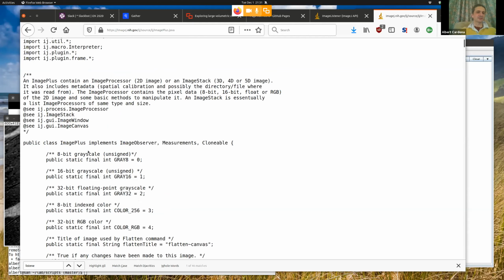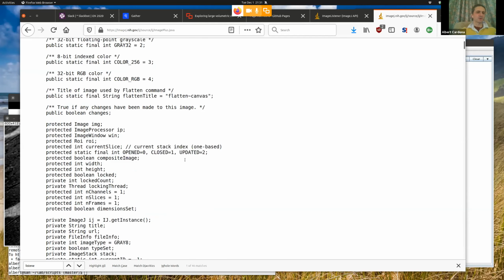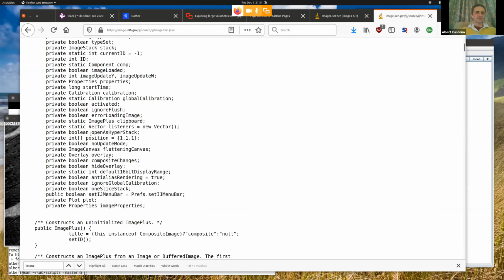And that's something that Java does horribly, which is it mixes together the namespaces with the classes. But this essentially is a namespace that also happens to be a class. And so this is a property of the namespace, this one right there. And this means we can get it. How do you get it? Well, we have the name, right? It's called listeners. Very good.